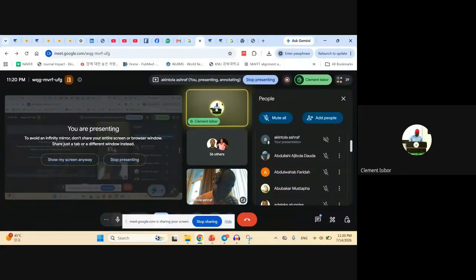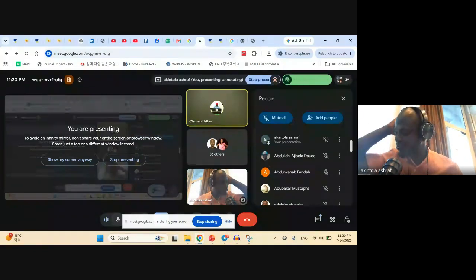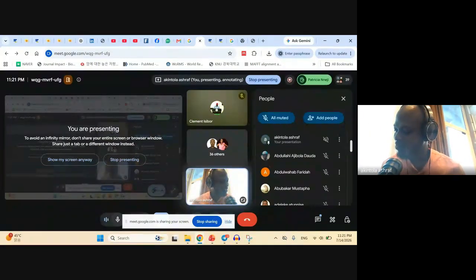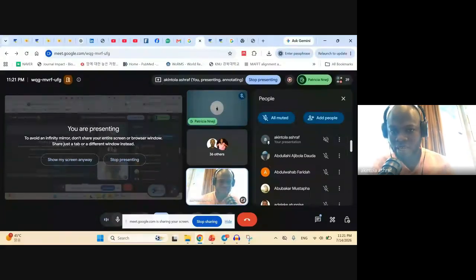Thank you for an excellent presentation. I needed to find out, can we do this with an accession number from NCBI? Yes, you can download, but you might not get it directly from an accession number on NCBI. You can download the data from NCBI and upload it onto the repository.